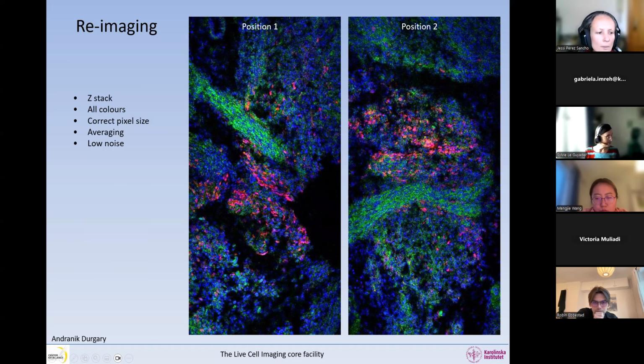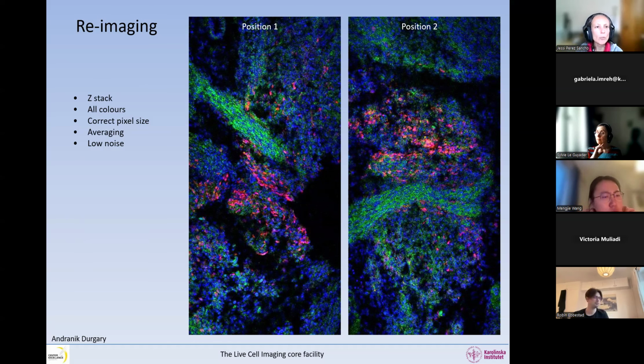Jessie, you have a question. But if we have inverted microscopes, if we want to change objective and you need to change a medium between different objective, you move the slide and then when you put it back, you are not exactly in the same position anymore. That's true. We have tricks. Yes, there's lots of tricks.